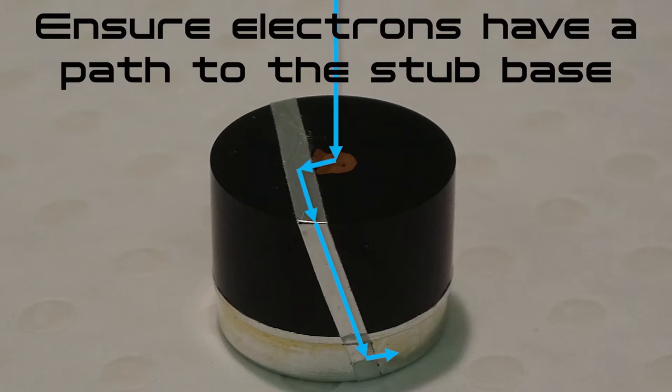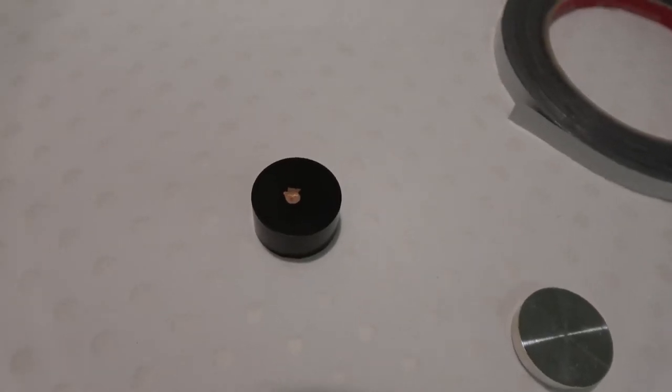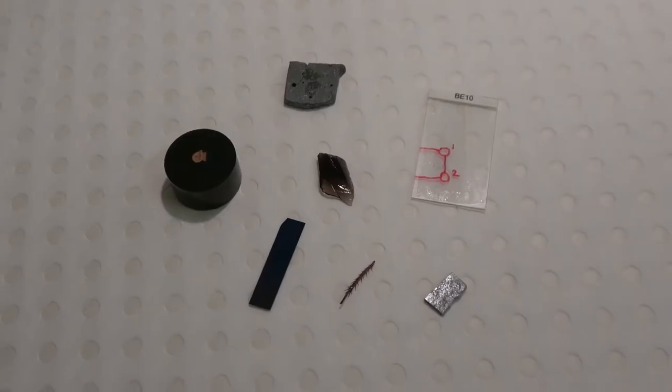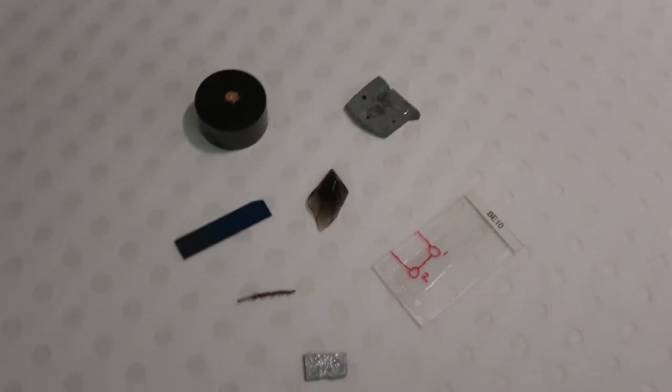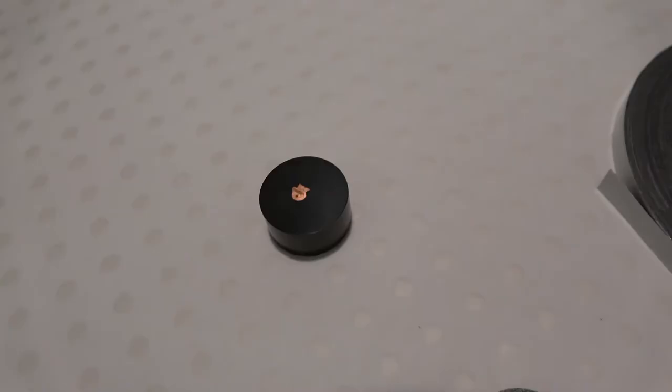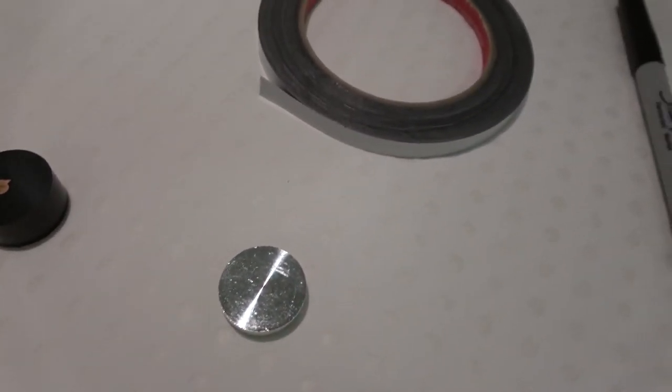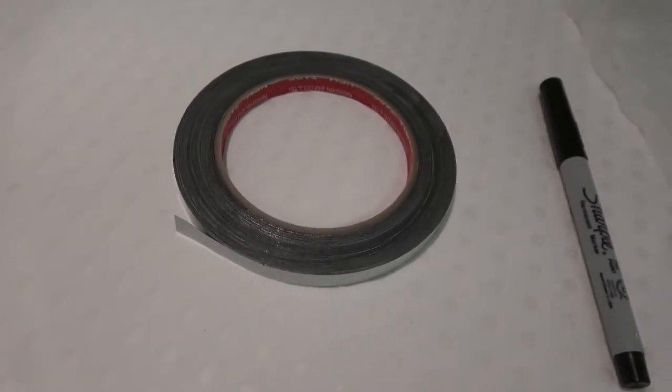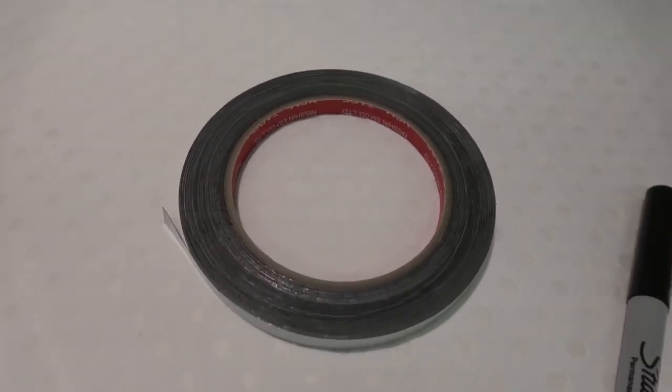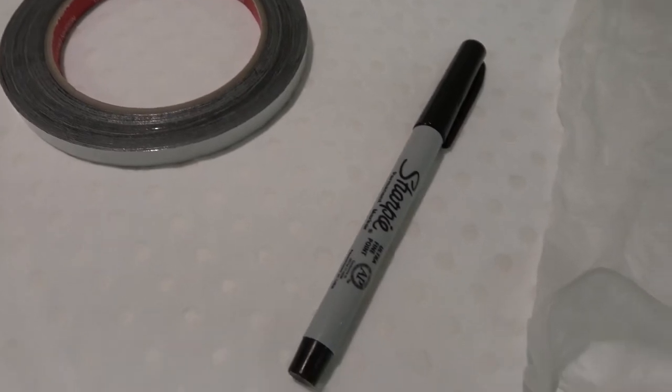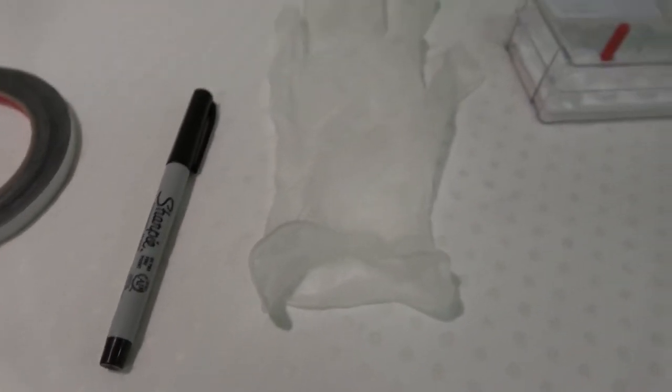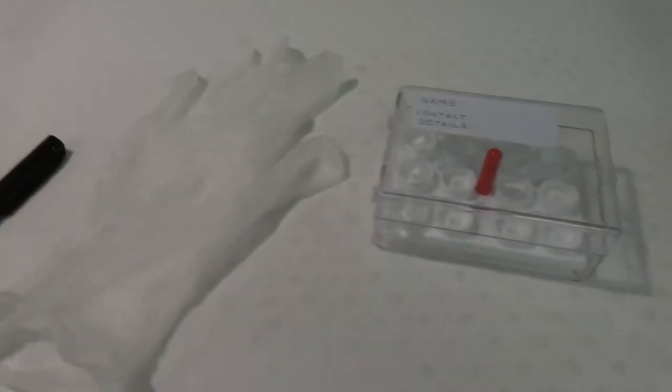Materials: a sample or piece of sample – use the smallest piece possible that you can easily manipulate and that contains your features of interest. An SEM stub, double-sided adhesive – at the EMU we provide users with double-sided conductive carbon tape. A fine permanent marker, gloves, and a SEM sample storage box.